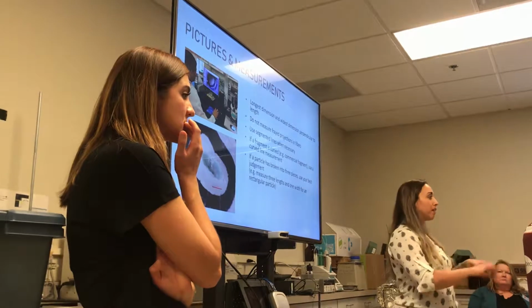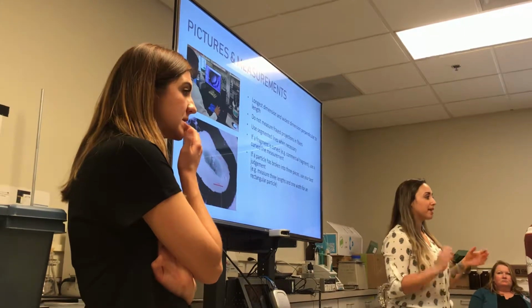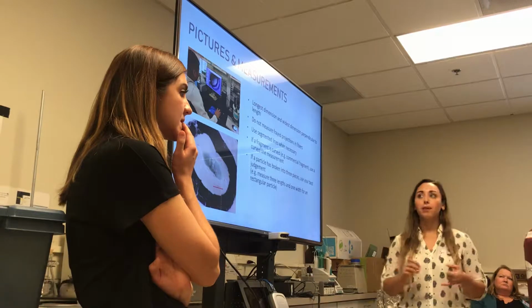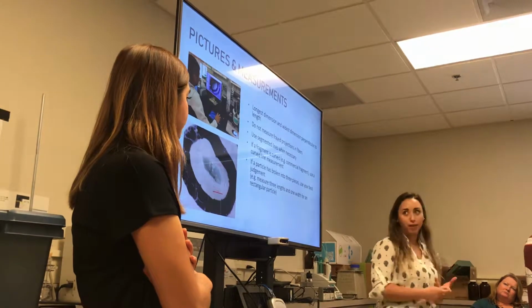So when you're picking your particles and you're putting them out on tape, I try to lay them as flat as possible. This isn't always easy, but do your best to lay them as flat as possible so that you can measure them accurately in 2 dimensions. We record the longest dimension as the length and the widest dimension that's perpendicular to that as the width. So it would be one length, one width.